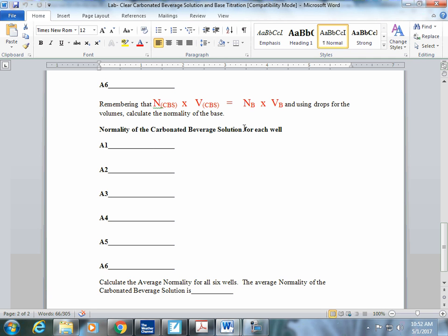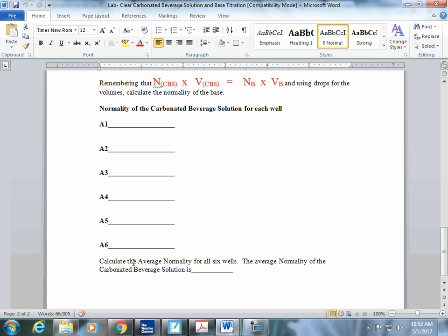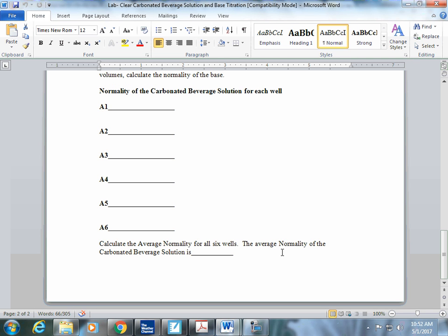Okay? Once we get finished, we need to find out what the average normality is for our carbonated beverage solution. So we're going to add up all 6 A1 through A6 normalities. We're going to divide it by 6, and that's going to give us the average normality of our carbonated beverage solution.